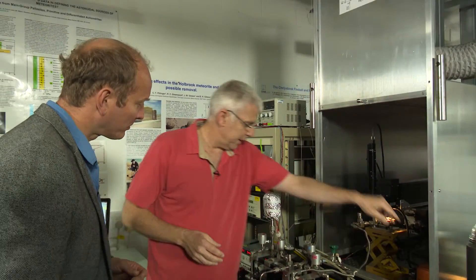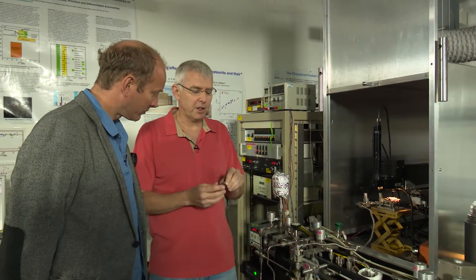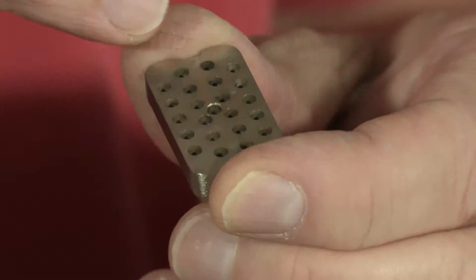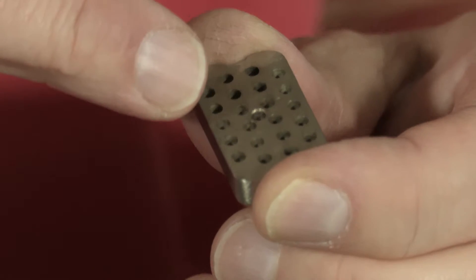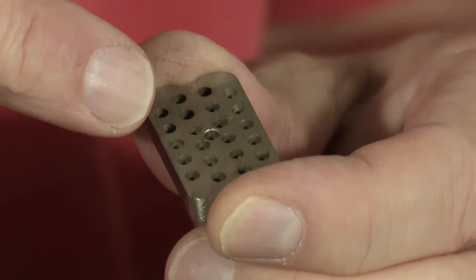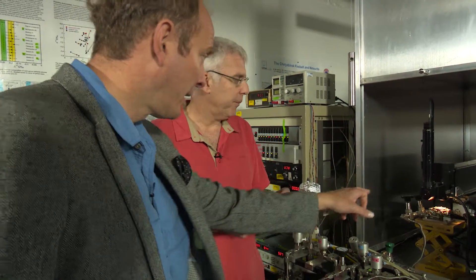So once I've got my sort of powders of my sample, what happens next? Well, if possible, we'd like to crush them up. But chips can also go in and the samples are loaded along with a number of standards into a sample tray like this. And we can load 15, 16, 17 different samples depending on how many standards we think we might need into a tray. And that's loaded in here then, is it?